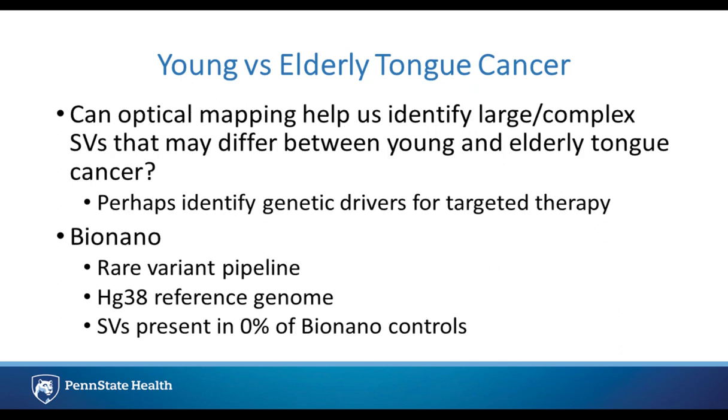And so the question I wanted to ask is if I could use optical mapping with Bionano to help us identify large complex structural variants that may differ between young and elderly tongue cancer.